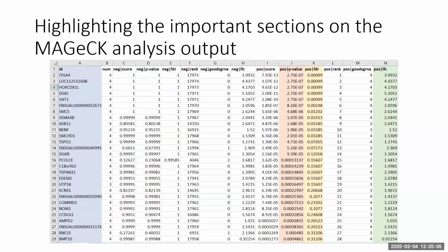So have you found the ITGA4 in the guide count Excel file? Yeah. So in the first column, you can see the guides range from about 200 to 1600. Is that right? Or, for example, for R17 PR8 low. And if you look at the column next to it, that's for the median population. And they're all considerably lower than the low population.